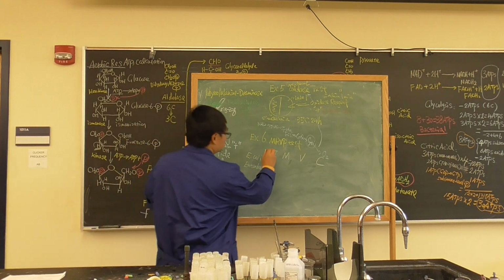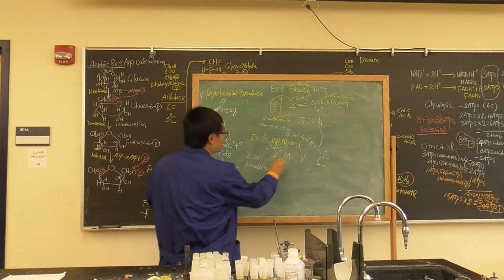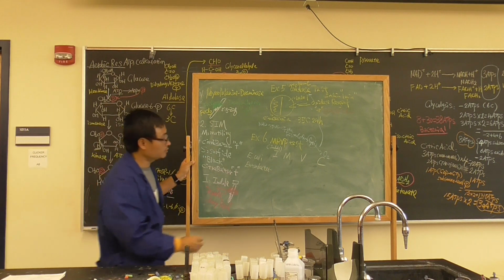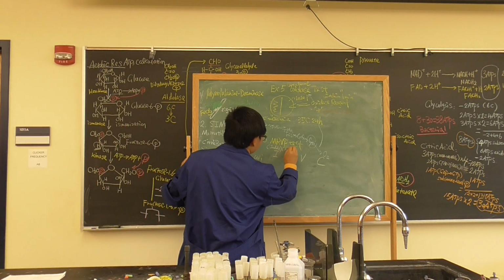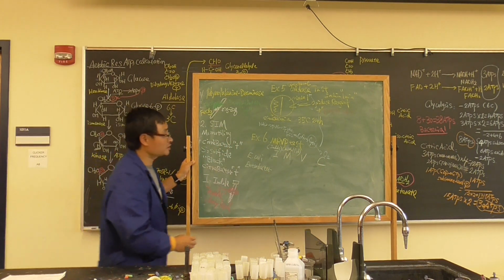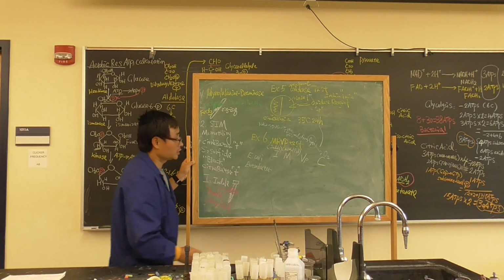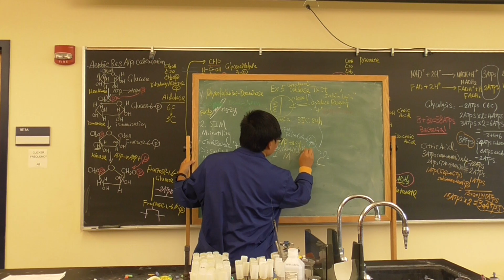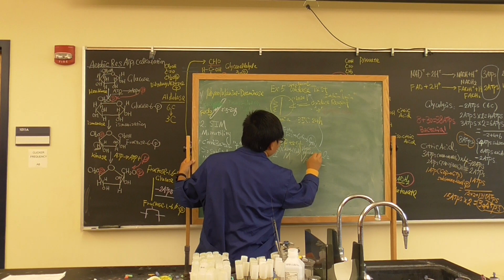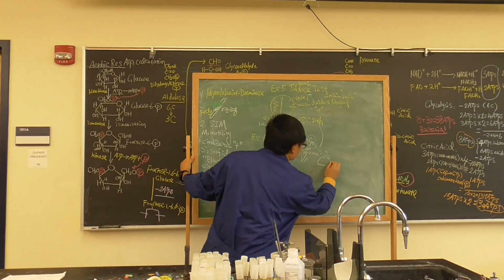What is I? That is Indole. What is M? That is not motility. That's methyl red. That was the mistake I just made. What is V? V is VP, but it is not vice president. It is Voges-Proskauer. And the last C is citrate.